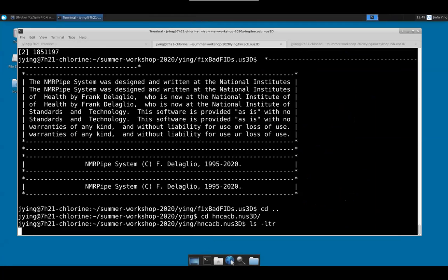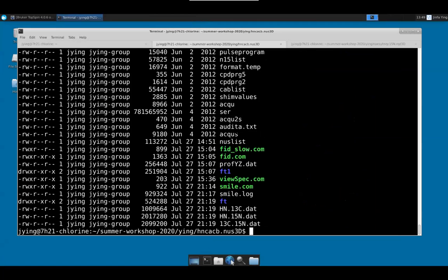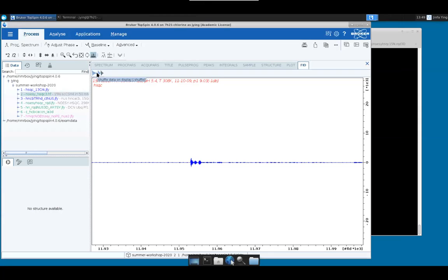Jin, I have just a question for you. Is it possible? Yes. This is Massimo. Just let me know if you tested this script also for TopSpin 4 or the NEO spectrometer, which are on the market now. You mean here? Yeah, the NEO, this is, okay, TopSpin 4, perfect. Because I just understood that this is tested on TopSpin 3.